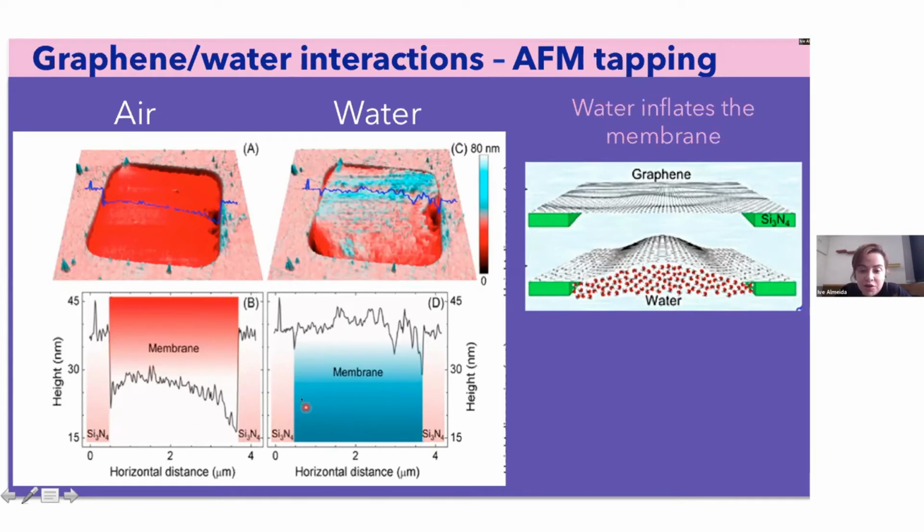It's clear that when water fills the channel, there is a pressure-induced swelling of the membrane, which means that the water inflates the membrane, as this picture illustrates.